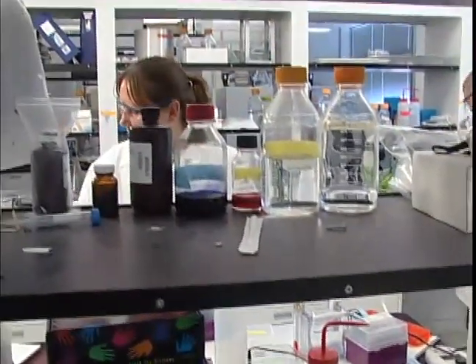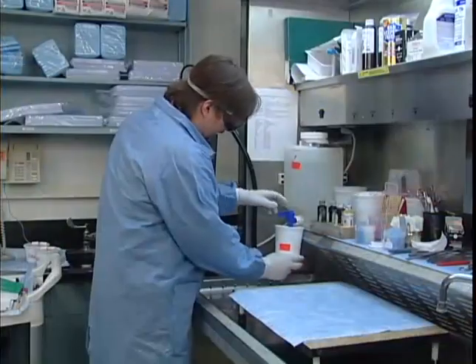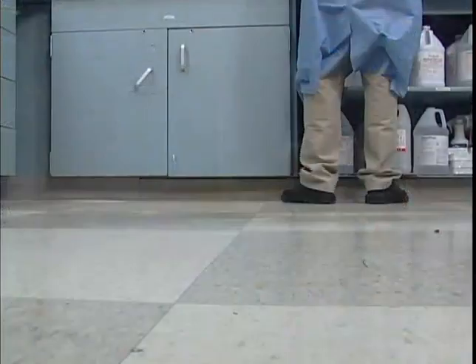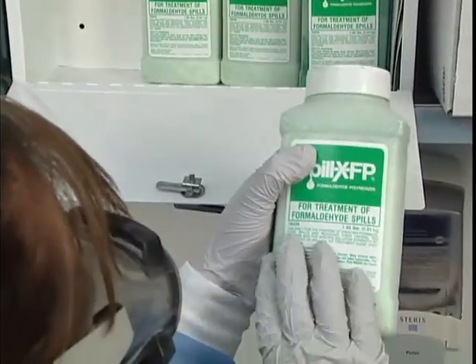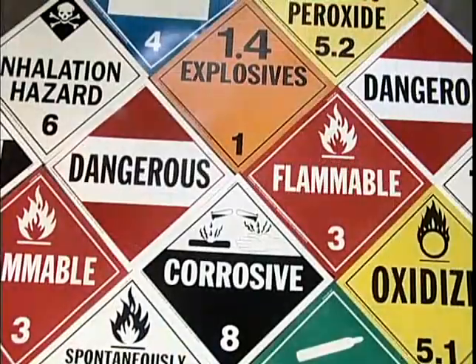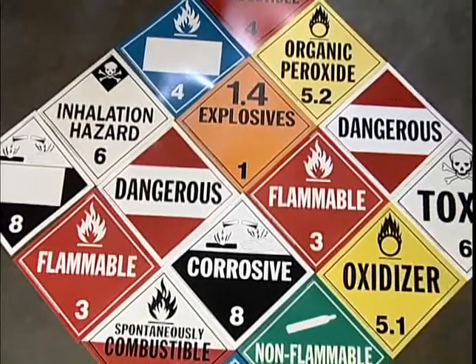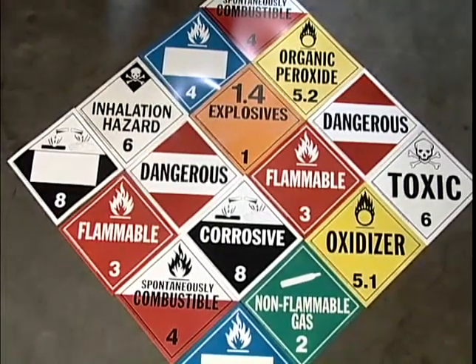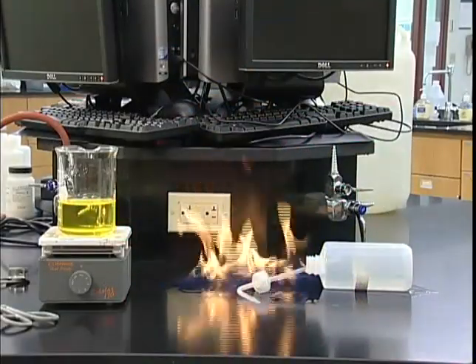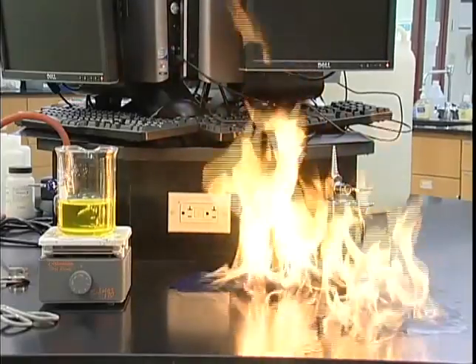Most of us encounter chemicals in one form or another every day. They're used in a wide range of products and laboratory processes and are often essential in our jobs. But if we don't take the proper precautions, many chemicals can be hazardous to our safety and health. There are many types of potentially hazardous chemicals: flammables, corrosives, irritants, sensitizers, toxins, even carcinogens, which can cause cancer. Each of these chemicals has its own set of hazards, required safety precautions, and recommended emergency procedures.